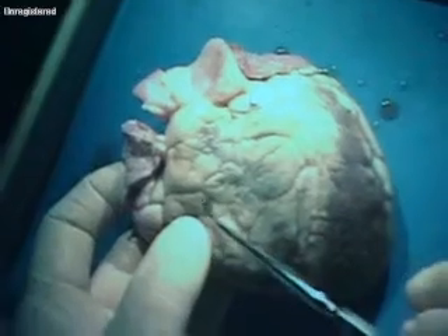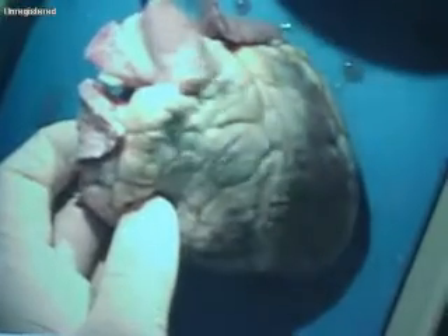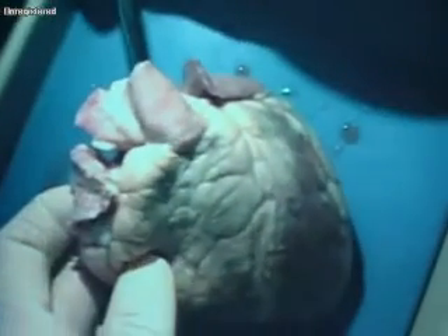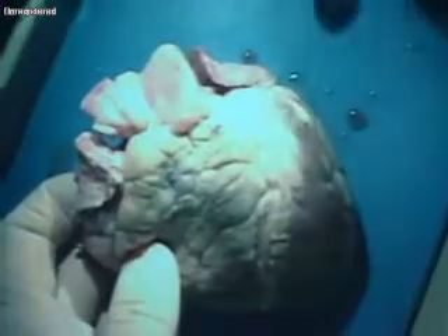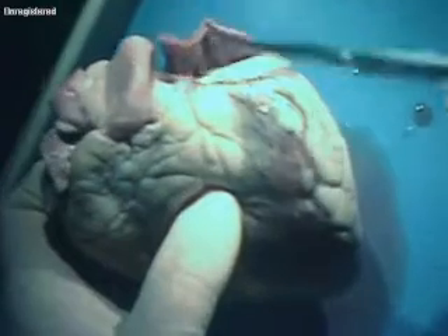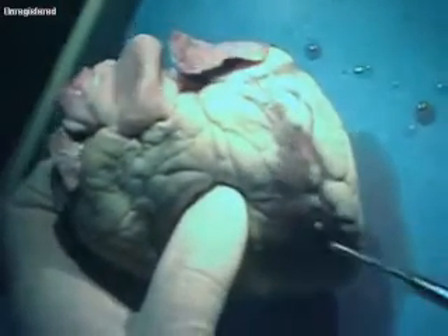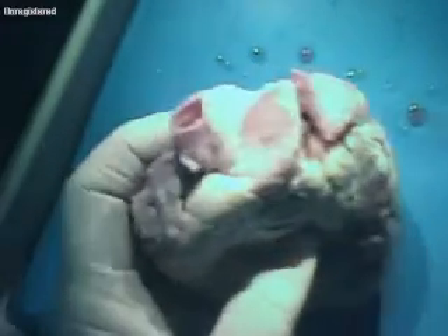The blood goes into the right atrium, through the tricuspid valve, into the right ventricle. From the right ventricle it goes out the pulmonary trunk to the pulmonary arteries, to the lungs. Then it comes back in through the pulmonary veins into the left atrium, from the left atrium it's going to go to the left ventricle, and from the left ventricle it's going to go out the aorta.